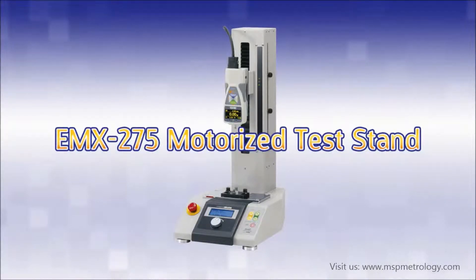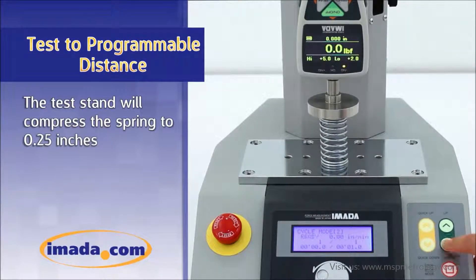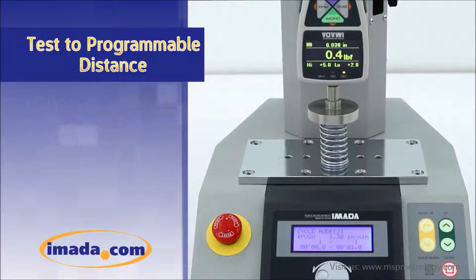With the EMX275 motorized test stand, users are able to test to a programmable distance. The test stand will compress the spring to 0.25 inches. Distance measurement resets automatically upon contact with the sample.